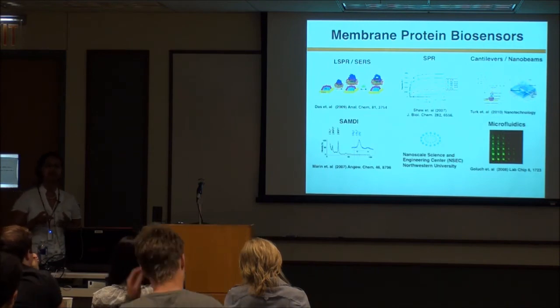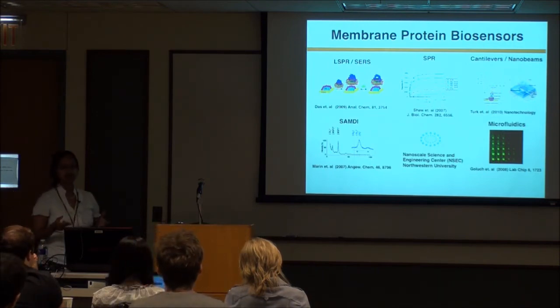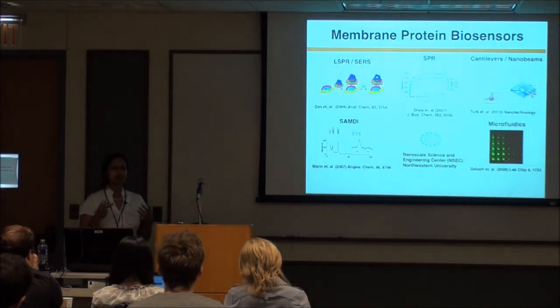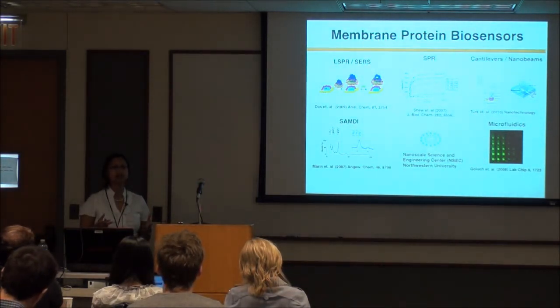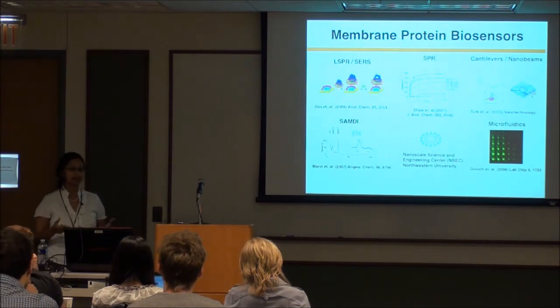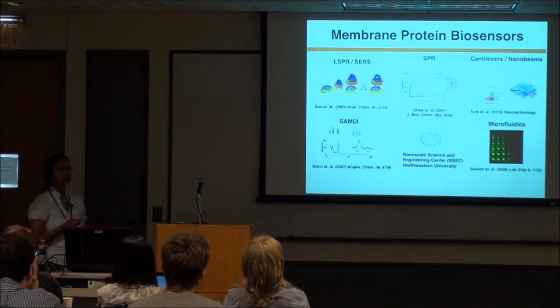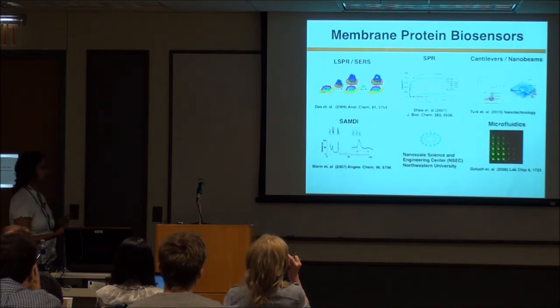So sometimes the membrane protein targets are not optically active. They don't have any chromophore. So you need a technique which does not depend on optical signal, and therefore that was the thought why we wanted to couple it with cantilever-based detection methods.